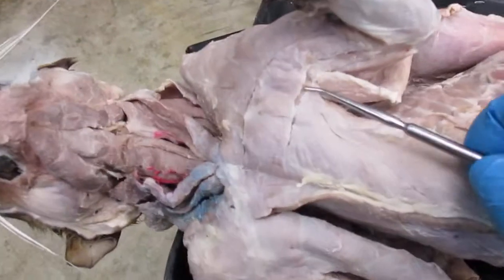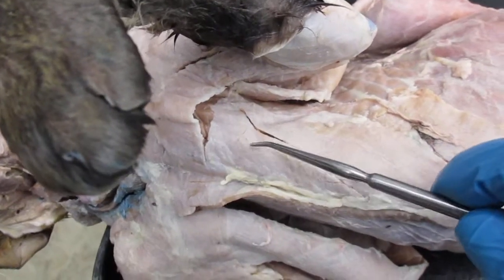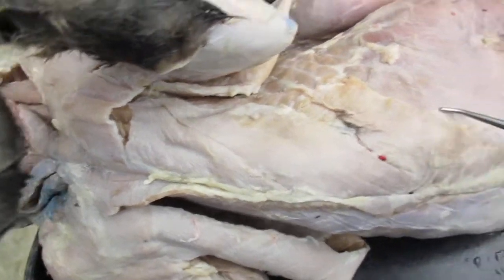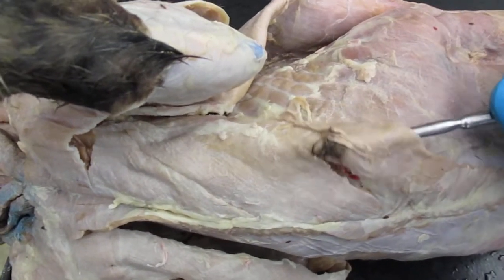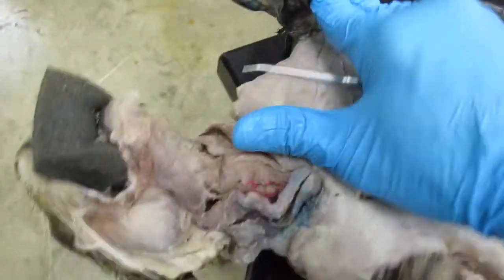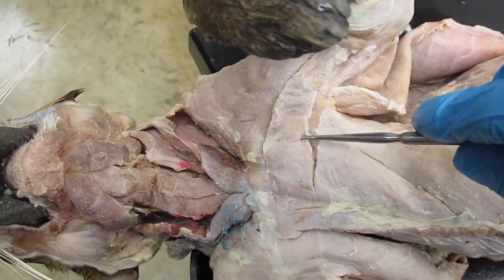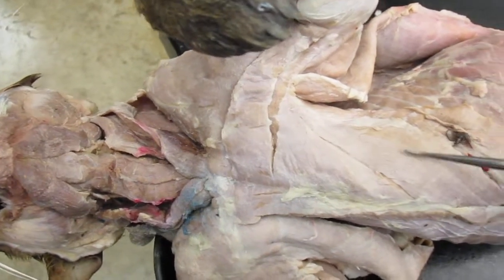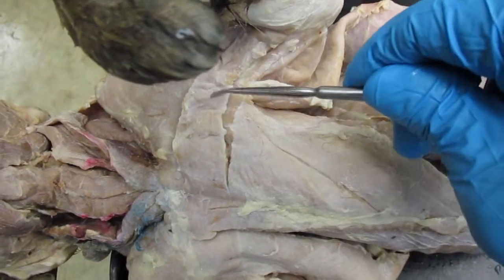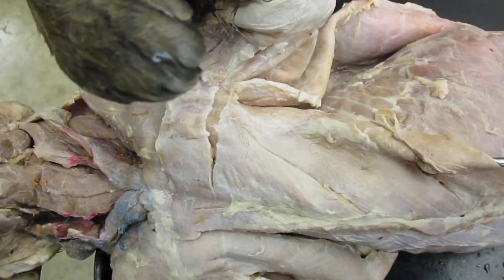So right here, we can see the pectoral antebrachialis right here. Pectoralis major, pectoralis minor, and then this one right here would be the xiphihumeralis. So we have the pectoralis major, minor, and then cat specific xiphihumeralis. This is the pectoantebrachialis, pectoralis major, minor, and xiphihumeralis.